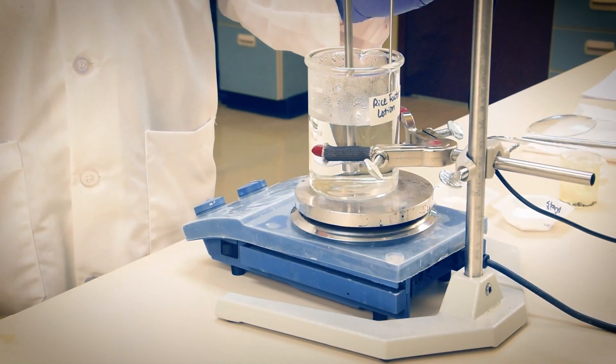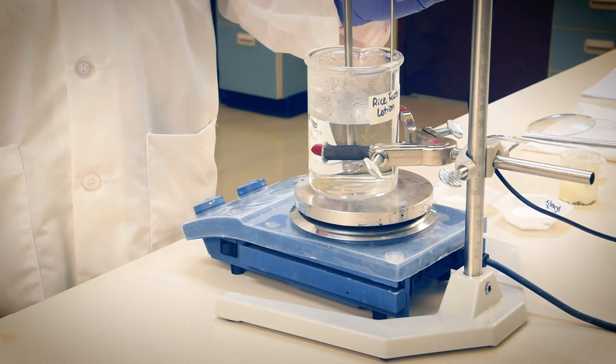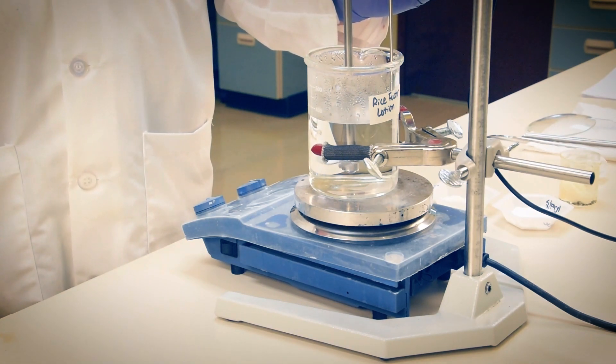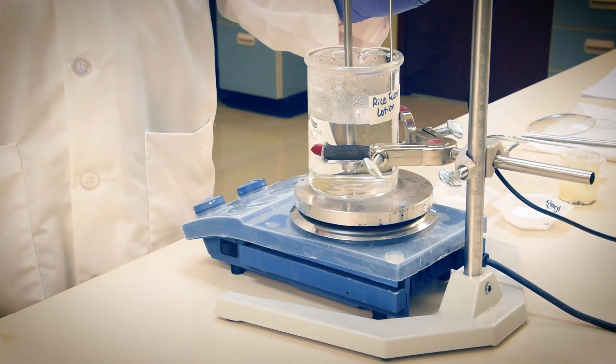We're compounding a 400 gram sample today, so here in our 500 ml beaker, we've combined glycerin, tetrasodium EDTA, and DL panthenol with deionized water. This will heat to 75 degrees Celsius and mix a short while to make our phase A.